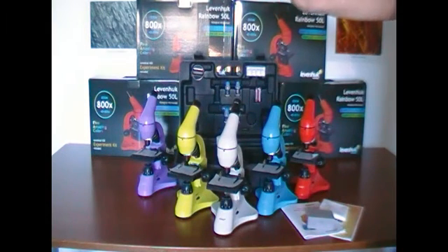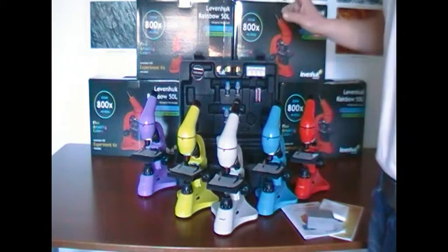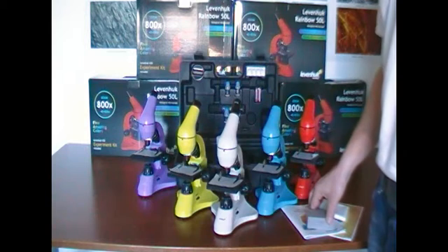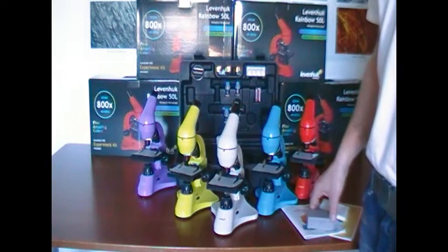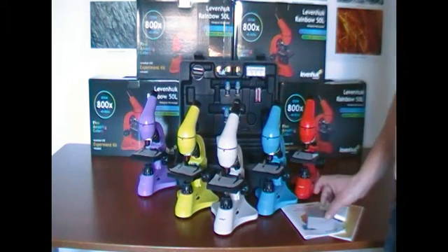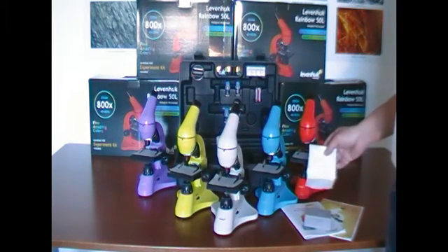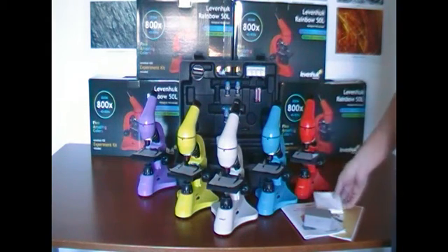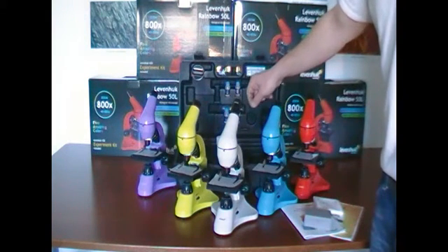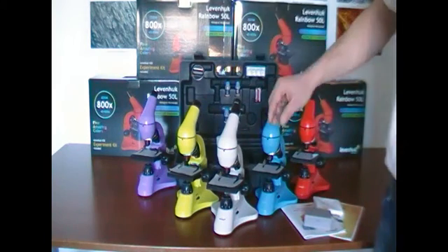This microscope is supplied in a case that contains many accessories, a book where I can learn how to get full use and enjoyment from the microscope, and a set of slides containing ready-to-use slides and blank slides, a microscope cover, plus an experiment kit for the preparation of new samples. This microscope is a very appropriate gift for beginners and students who want to improve in the field of microscopy. Thank you.